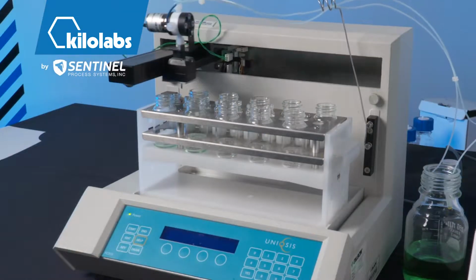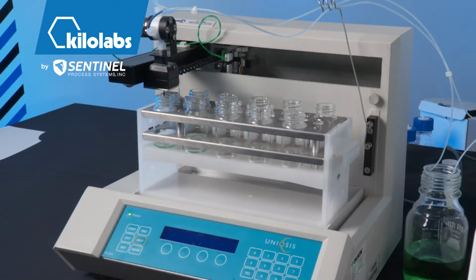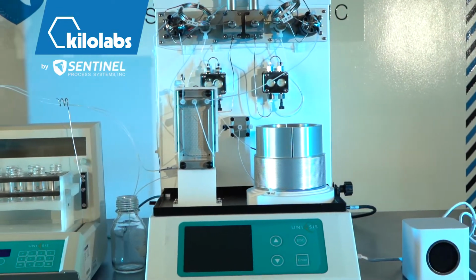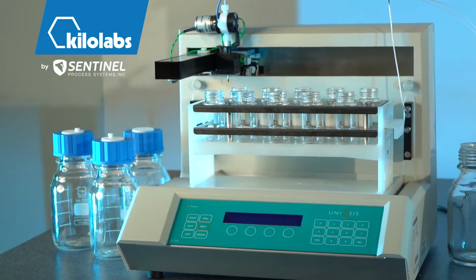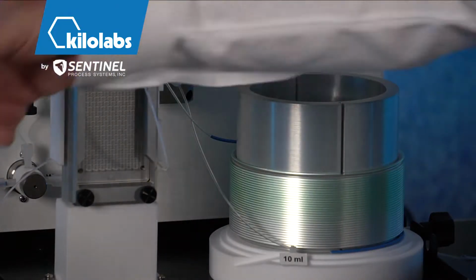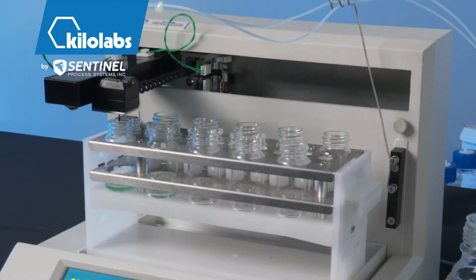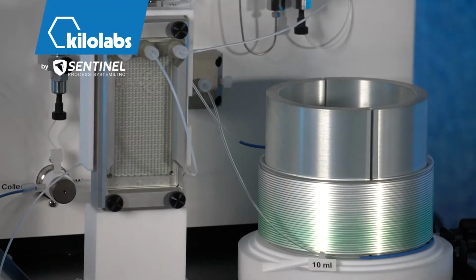Now the fraction collector just came to life, and we're collecting our product in these sample vials. This has collected the aliquot of 0.2 ml, and now it's collecting the rest of it. In essence, it's only the hard cut of the reaction product, and as the rest of the coil empties, it goes directly to the fraction collector. So that's the first experiment, and we've got 1 minute and 30 seconds left in it.